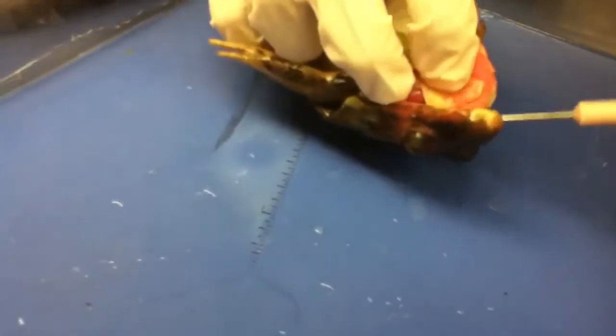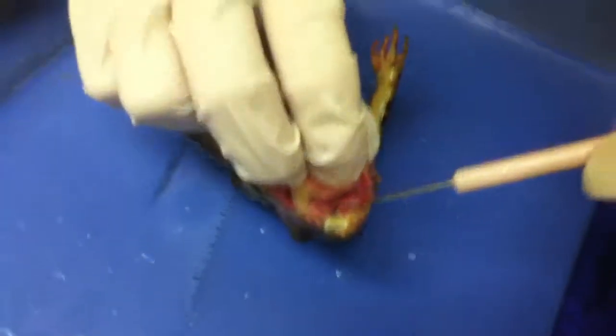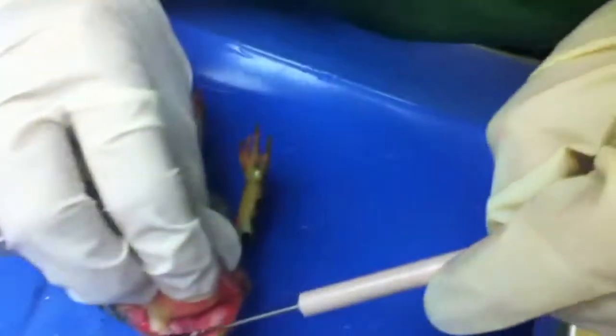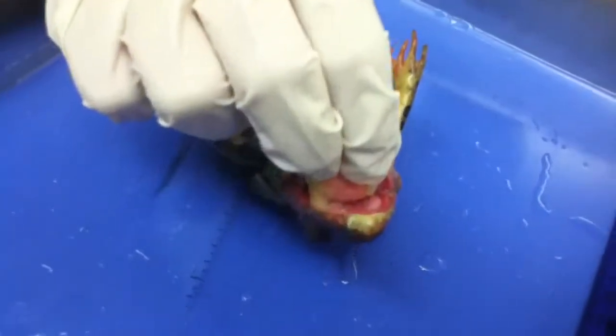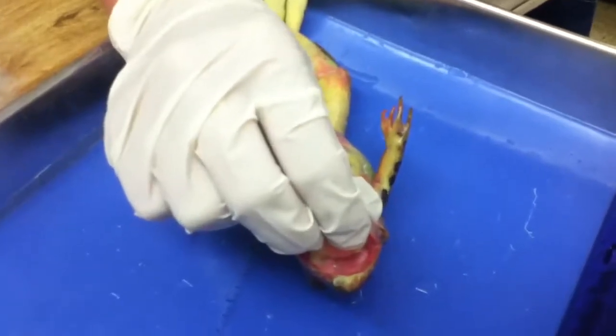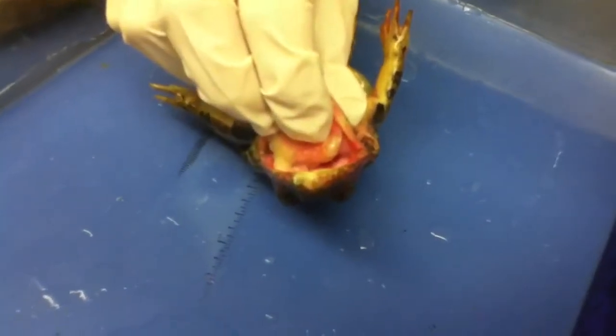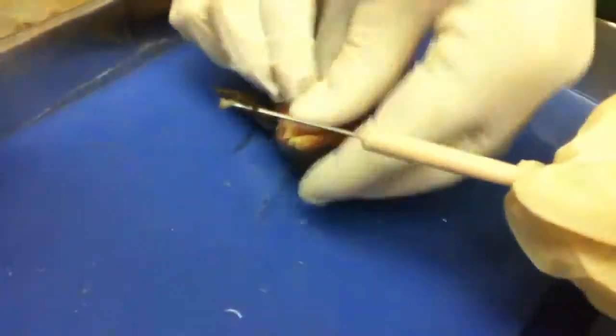His tongue. All right. What do you think the function of the nictating membrane is? What's this black thing in his mouth? It's cavities. What do you think the function is of the nictating membrane? Sorry, Ashley. I don't know, but I found this in his mouth. Maybe he was eating. Mr. Moore, I found something in my frog's mouth. You found something in his mouth. Yeah, it was black. Don't tell anybody. Now everybody's going to want one in there because he's hungry. It was black. I don't know what it is. He's eating. Let me show you something. Are you snipping his mouth more? Yeah.